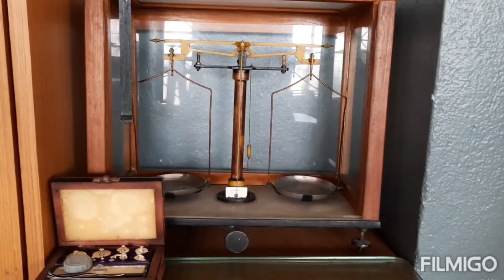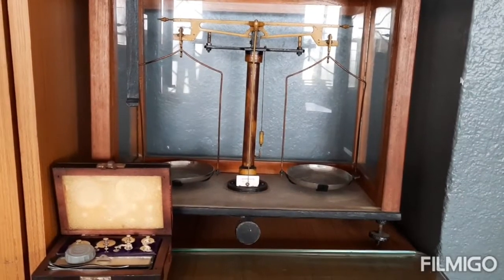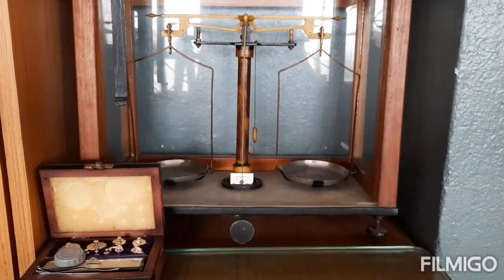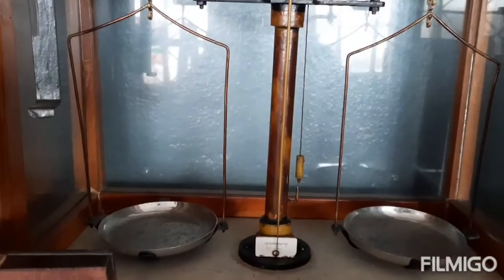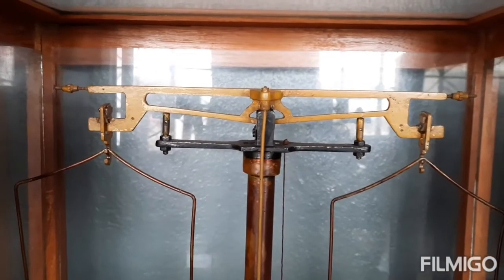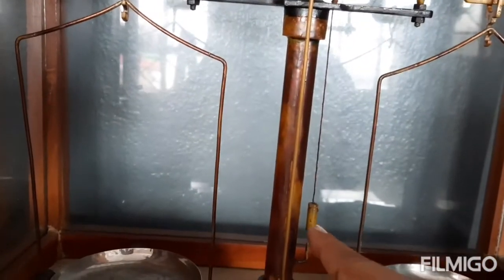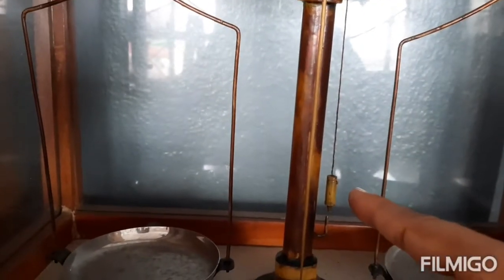This is a physical balance. Today we are going to weigh something and see how a physical balance works. These are the two pans and it is pivoted — the arms are equal.